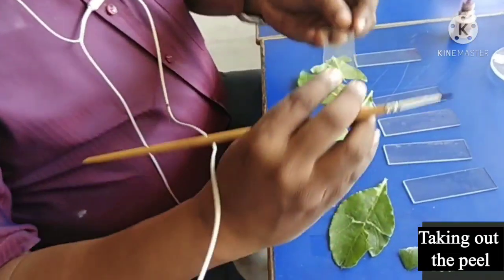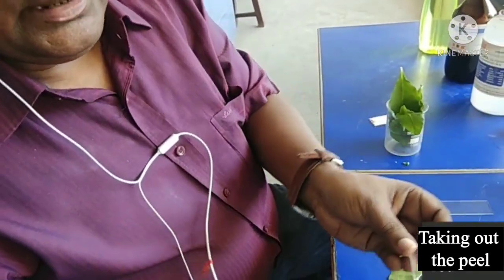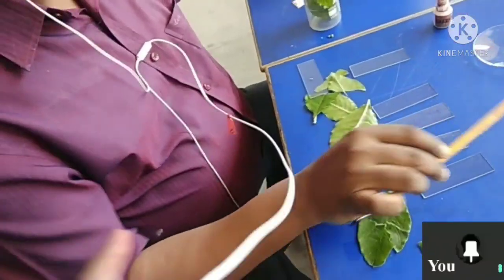This thin layer part is now on the slide, and here I have given a few drops of water to keep it alive. The next part we are going to do is staining.